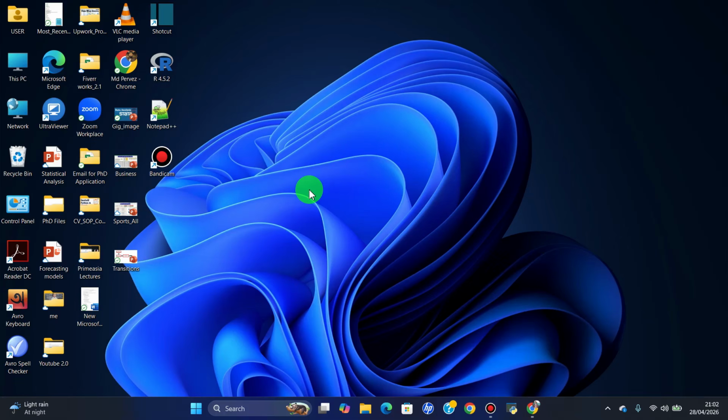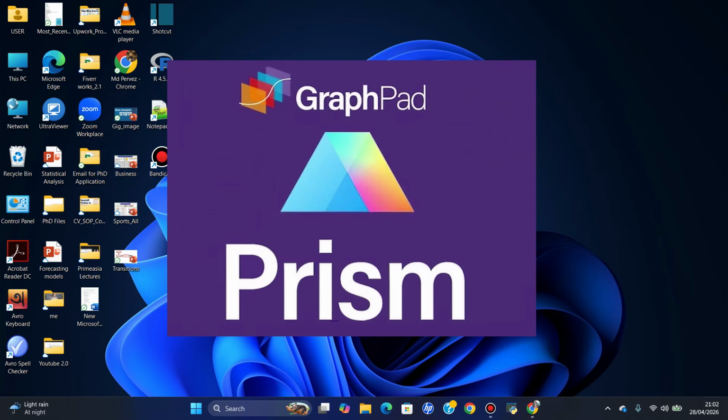Hello and welcome. Today we will see how to download and install Prism GraphPad for research data analysis.